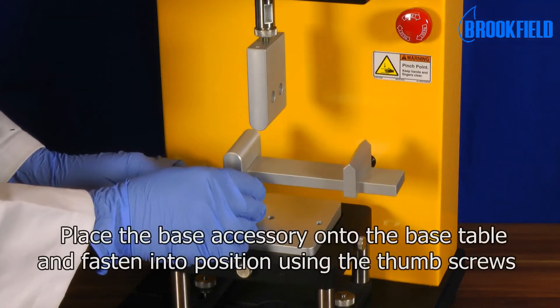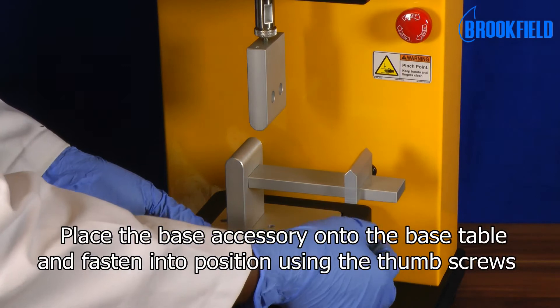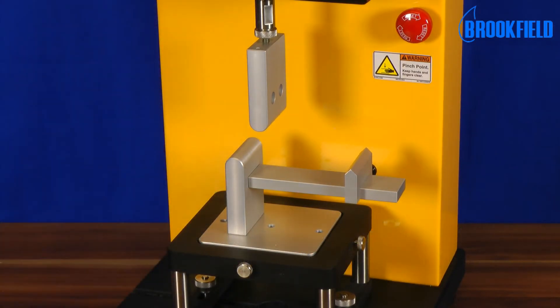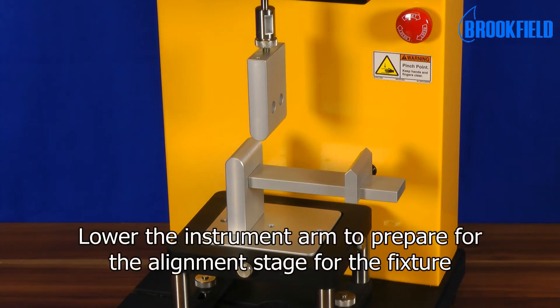Place the base accessory onto the base table and fasten into position using the thumb screws. Lower the instrument arm to prepare for the alignment stage for the fixture.